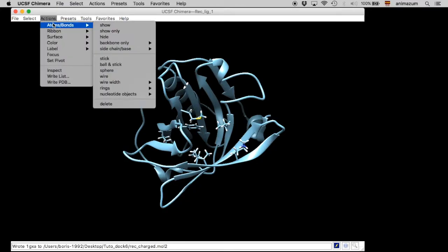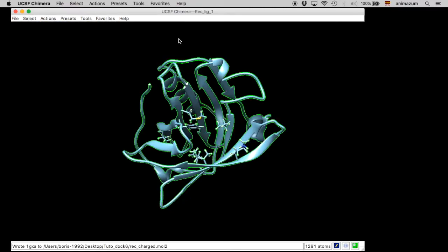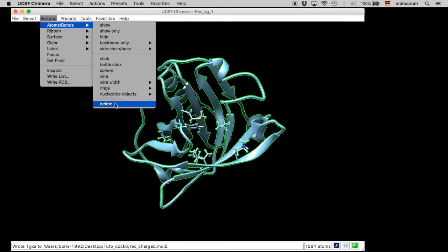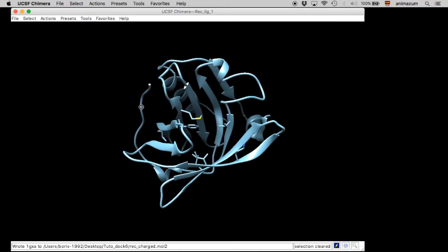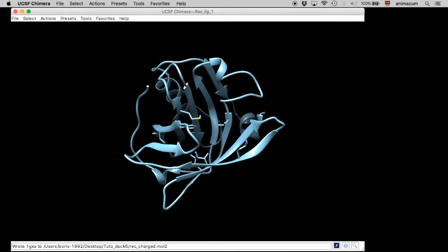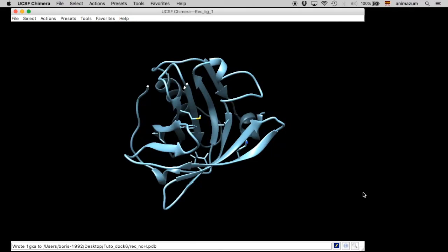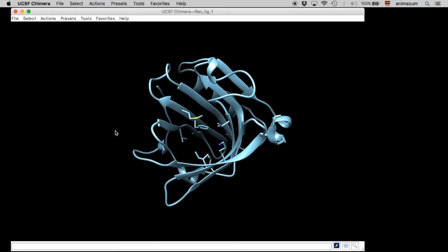Then, we are going to create another receptor but without hydrogens. This is important because we are going to use this structure too for our docking. Eliminate the hydrogens and then save the receptor as PDB. Here is an example — I choose the name 'REC_noH.pdb'. Save.